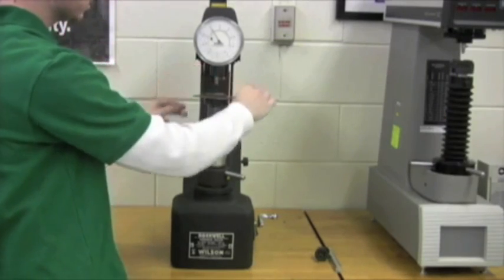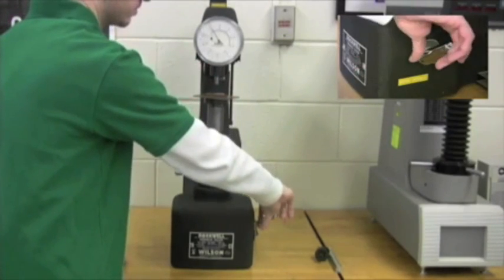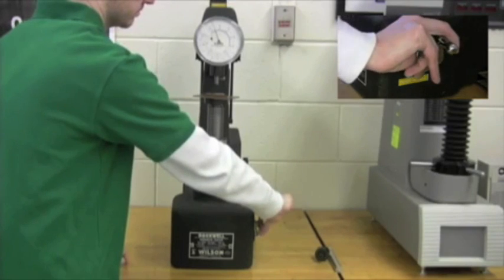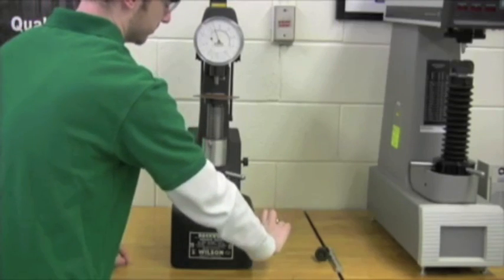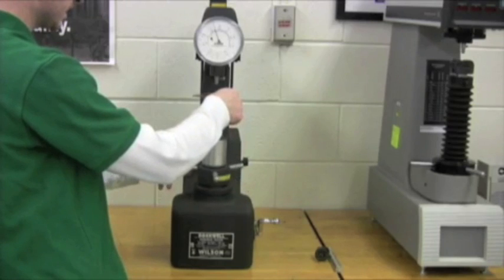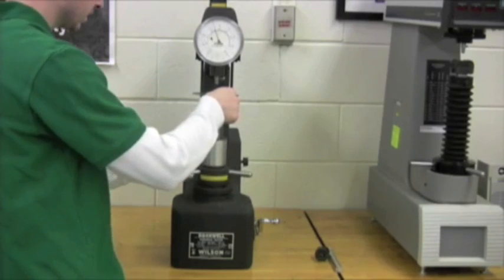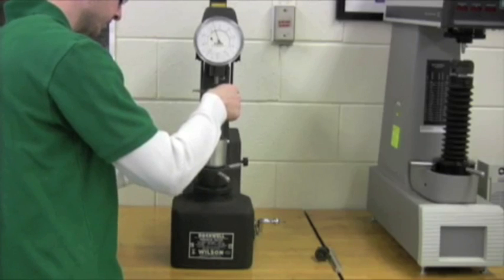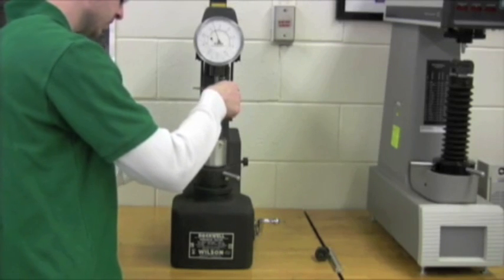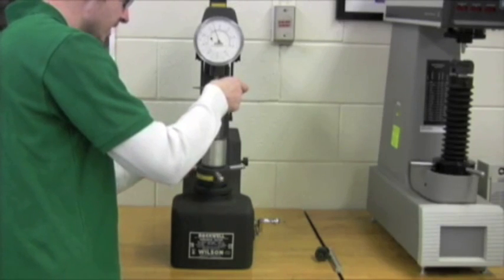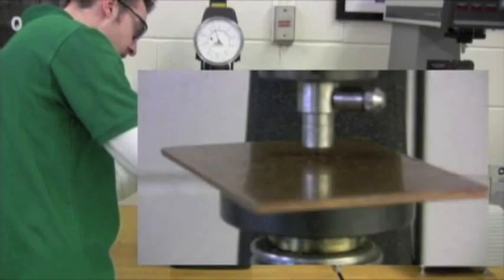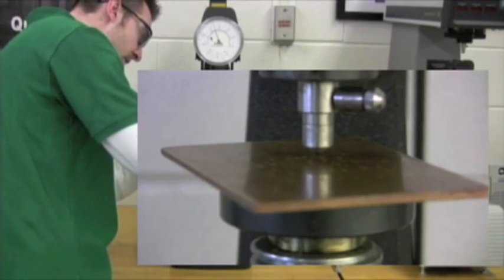Now first thing we want to do, is take our hand brake, pull it back like that. And we're going to take our hand wheel, and we're going to tighten it up. Let's bring it this way. And we're going to want to make sure that we don't have any of the divots touching the penetrator.